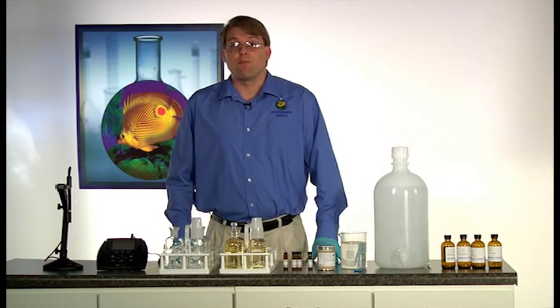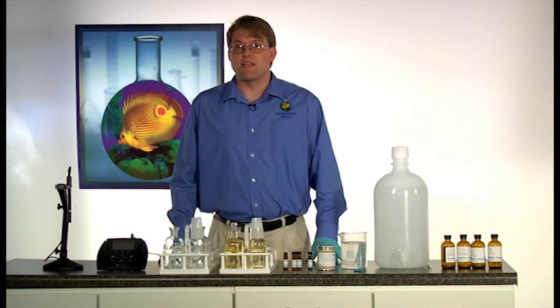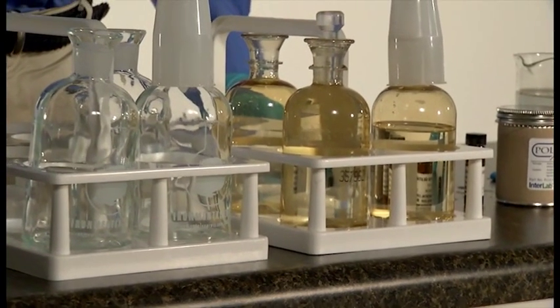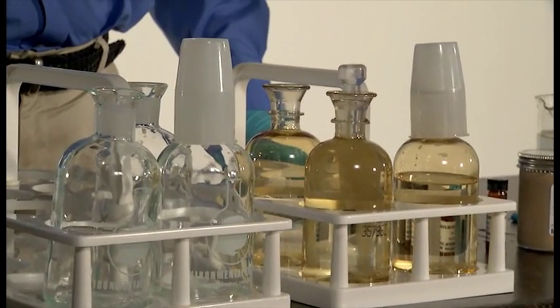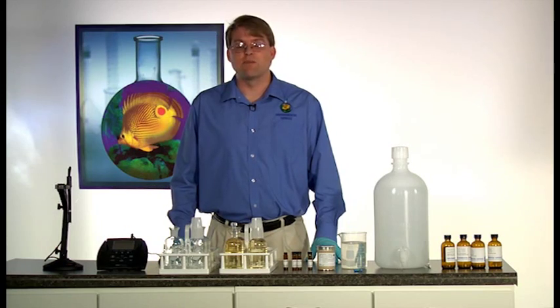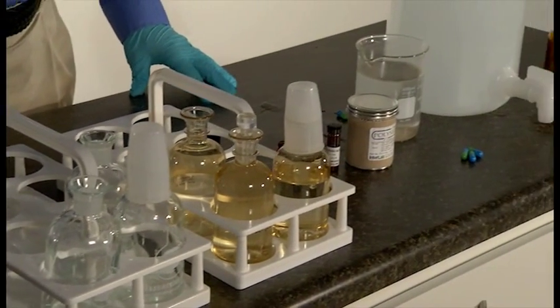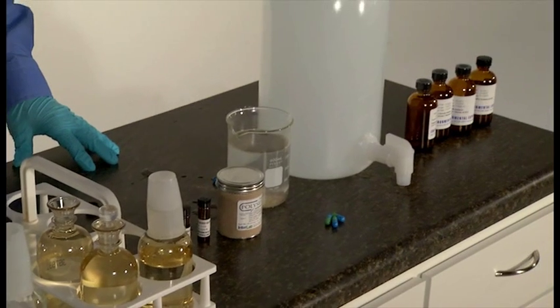Each sample needs to be checked for the proper pH range and the presence of chlorine. If the sample is outside of the acceptable pH range, it needs to be adjusted with dilute solutions of sulfuric acid or sodium hydroxide. Chlorine, if present, needs to be neutralized with sodium sulfite. Each sample needs to have several dilutions prepared to ensure an appropriate BOD value.